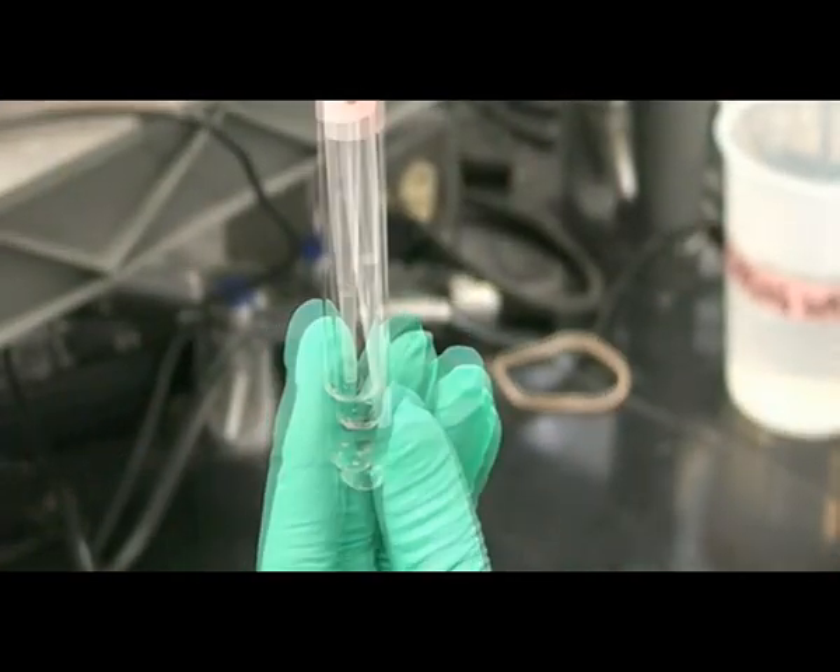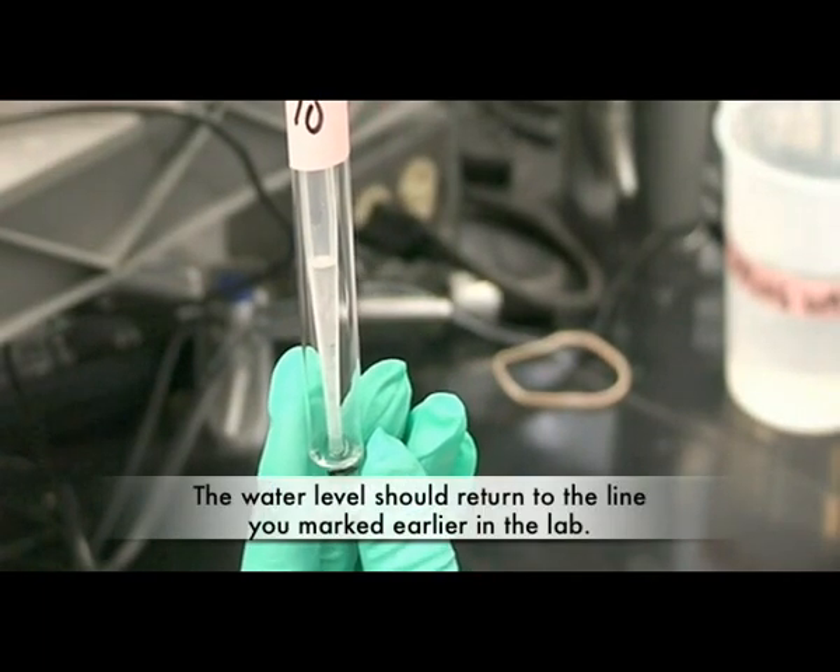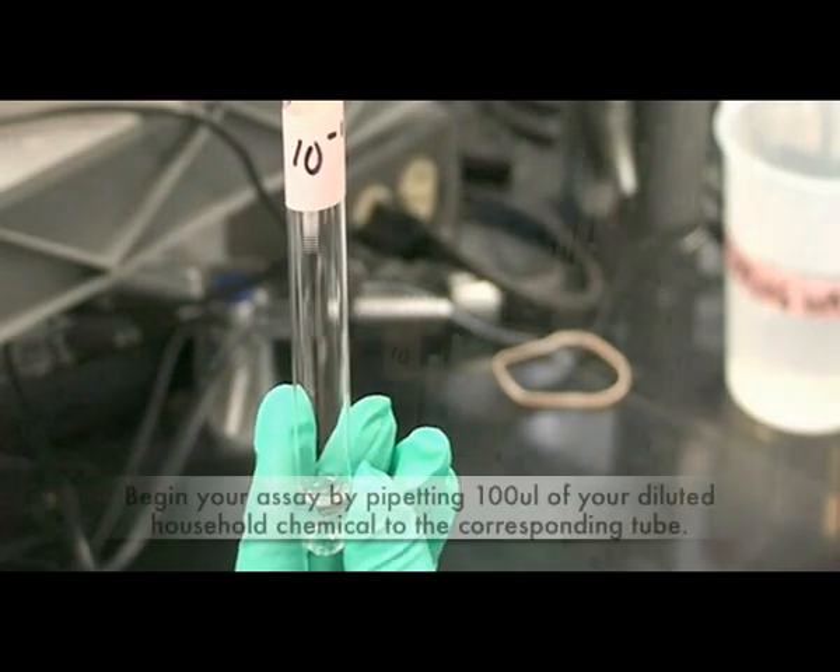Using a micropipetter, remove the excess water. The water level should return to the line you marked earlier in the lab.